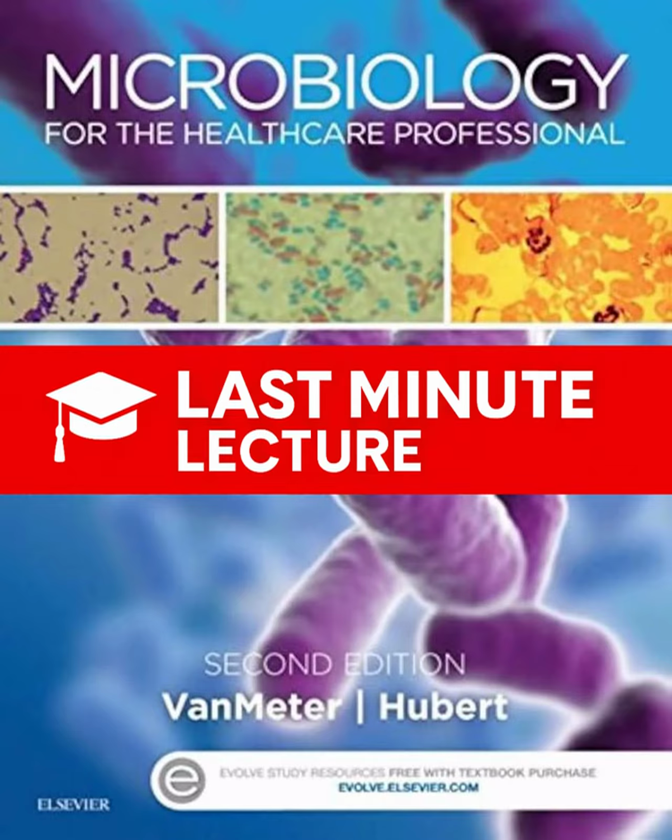I'd say number one, everything hinges on strict aseptic technique. Can't do anything reliably without it. Number two, we use a whole arsenal of culture media, carefully chosen, enriched, selective, differential, to grow what we need and see what it's doing. Three, the gram stain is still that fundamental first look, dividing the bacterial world based on cell wall structure. It's quick, informative. And four, identification is moving rapidly towards molecular analysis, DNA fingerprinting, probes, sequencing, because it offers unparalleled speed and specificity, especially for tricky organisms.